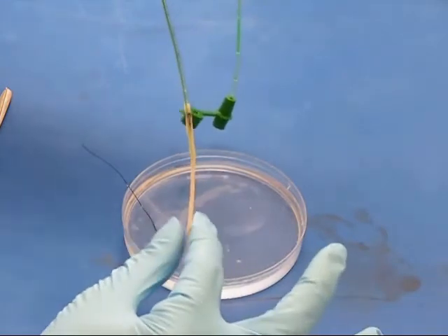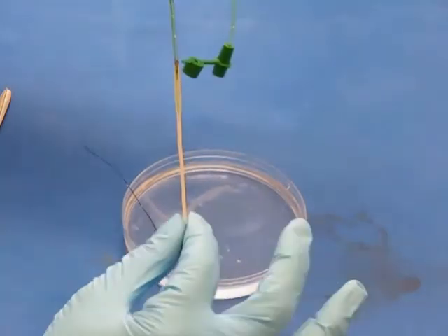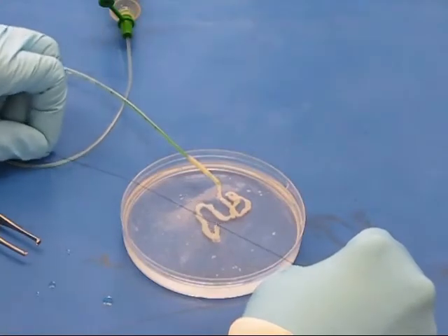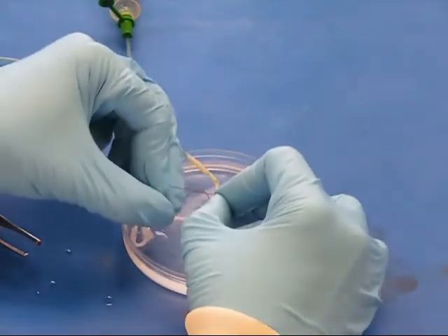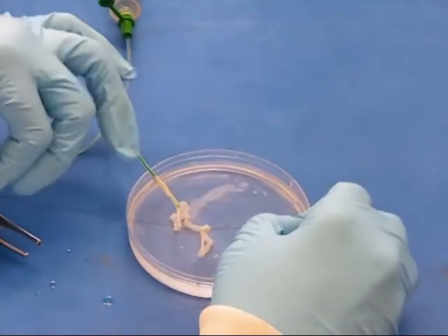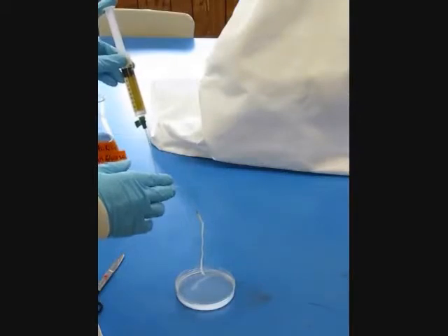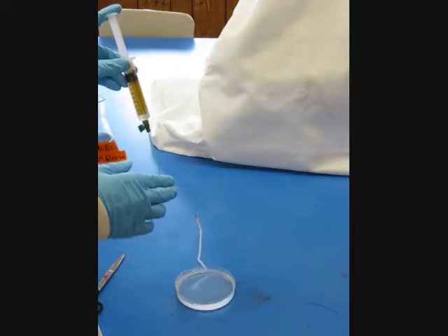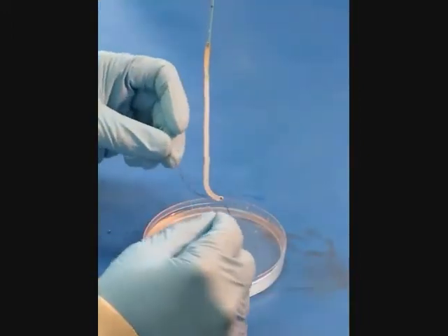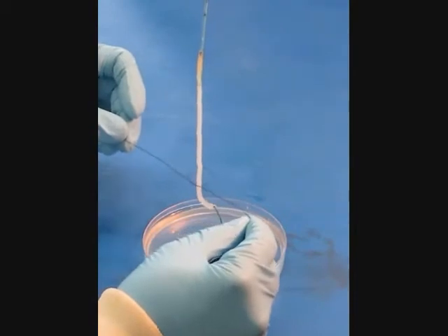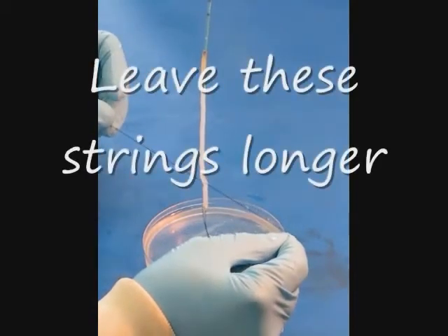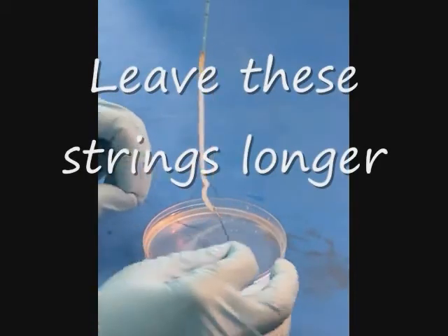From this point on do not touch the everted intestine except by the sutures you are about to attach. Now tie another double knot at the open end of the intestine. Gently begin to dispense the solution from the syringe.